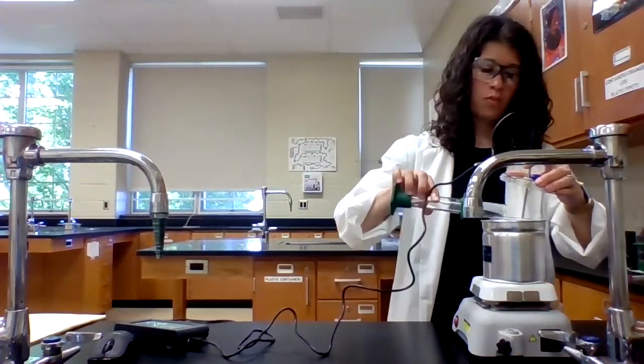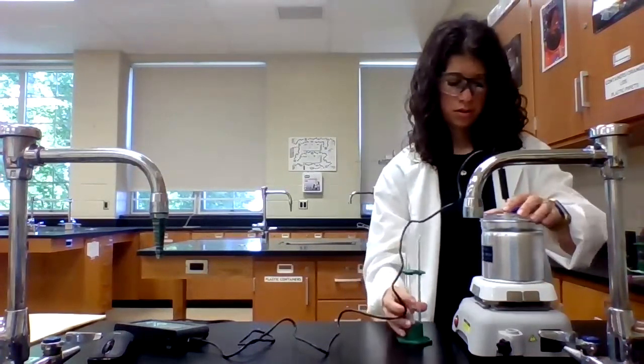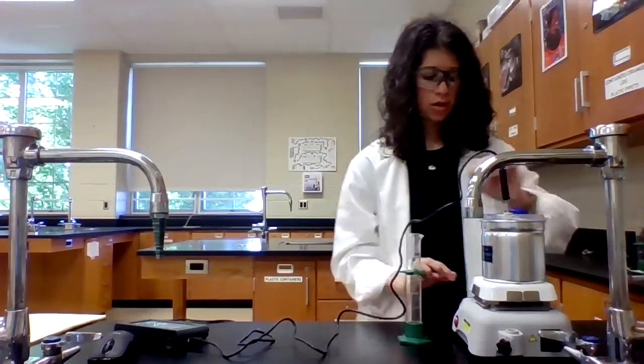And then I'm going to put my temperature probe in, add the warm water, stir, and then every 20 seconds, I'm going to monitor the temperature over 3 minutes.